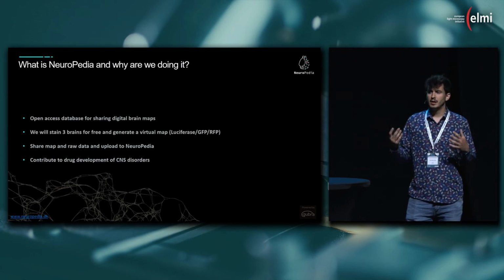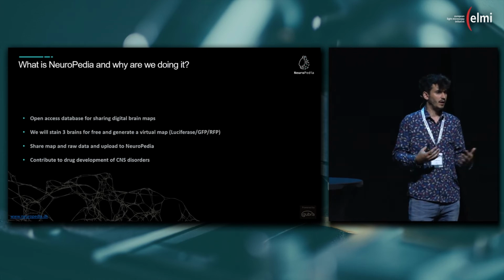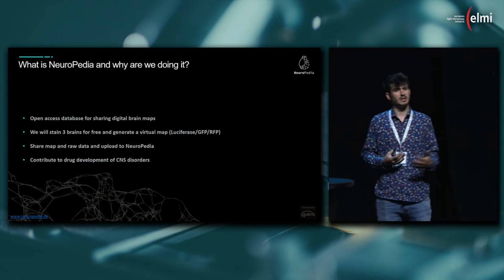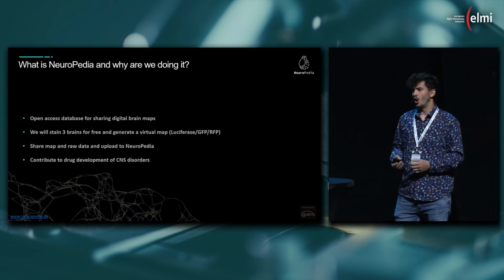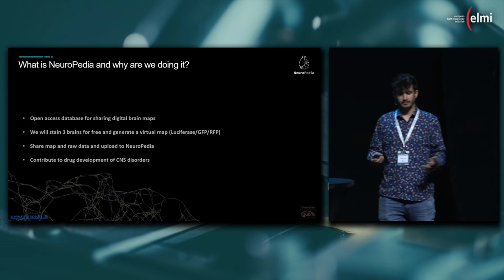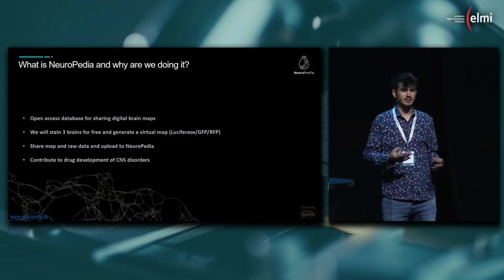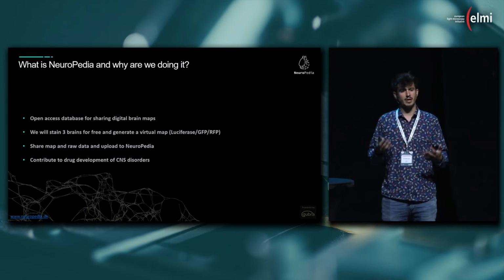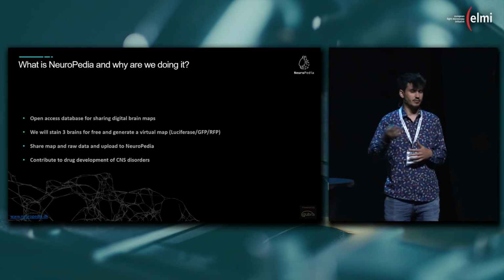When we find CFOS activity in a given nucleus of the brain, this is the only dimension that we know about it, but what else is in this nucleus? What type of markers, what type of peptides, what is the connectivity of that nucleus? What is the anatomy? For that, we thought that given our capacities of imaging, data analysis and referencing to an atlas, we are in a good position to collaborate with labs across the world.